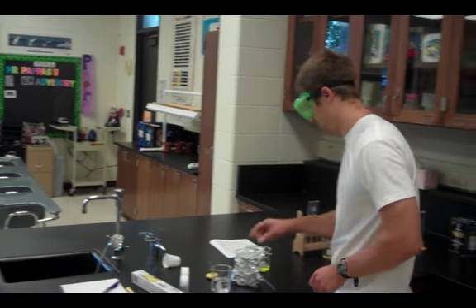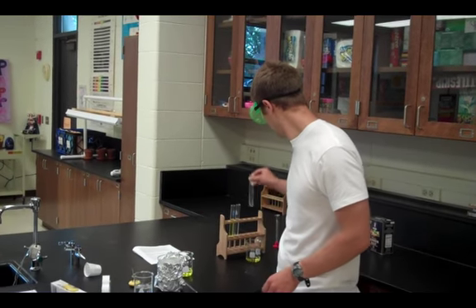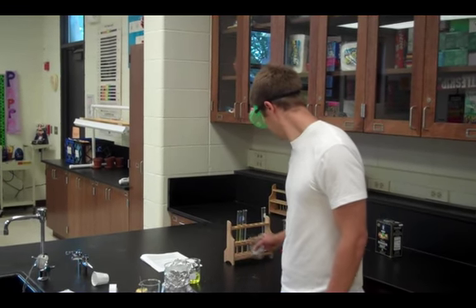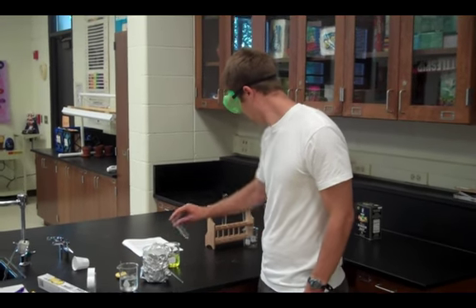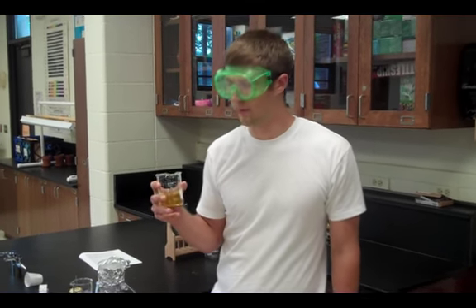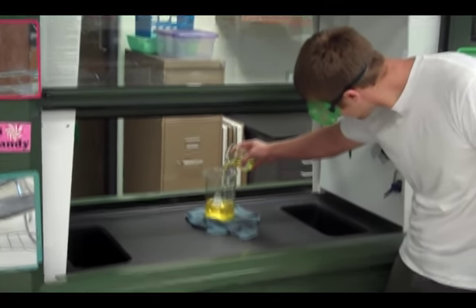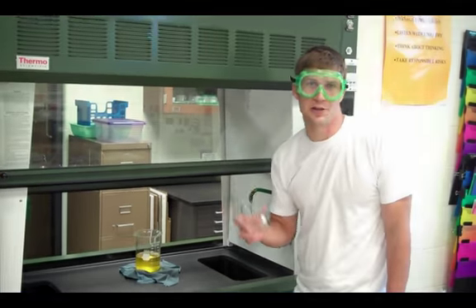And then I'm just going to take my solutions and combine them all into one beaker here. Then I'm going to take that and I'm going to take it to the fume hood where we're going to collect the antifreeze when we're done. I'm going to make sure that I rinse out all my beakers and test tubes that I use for this experiment.